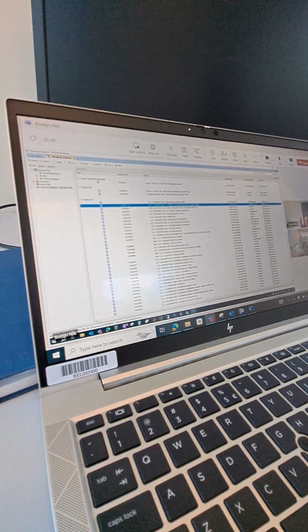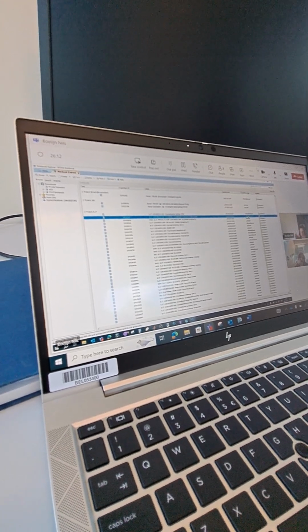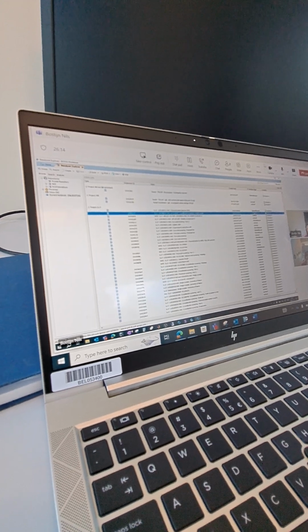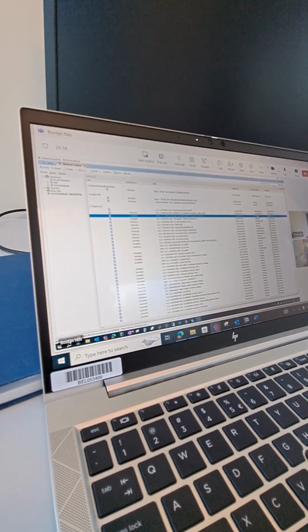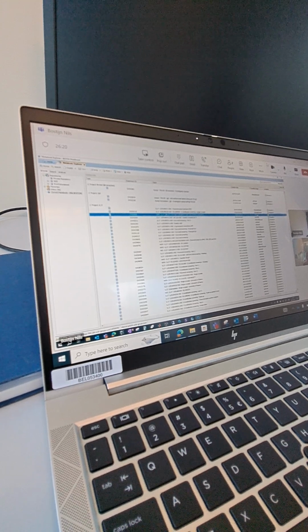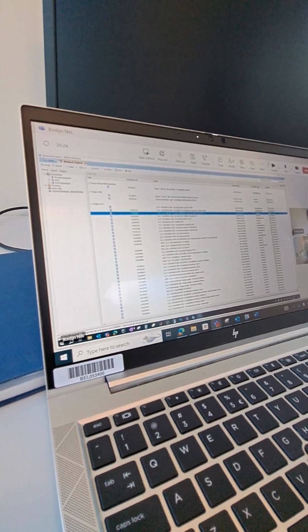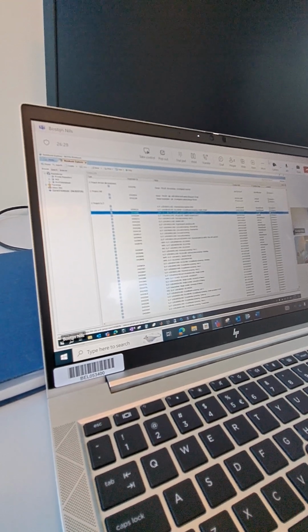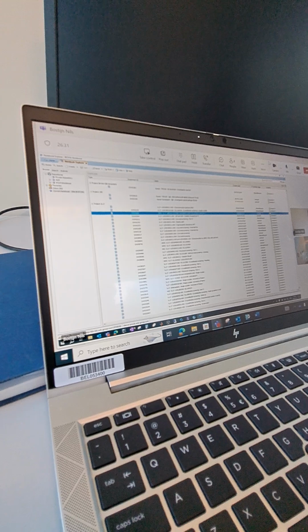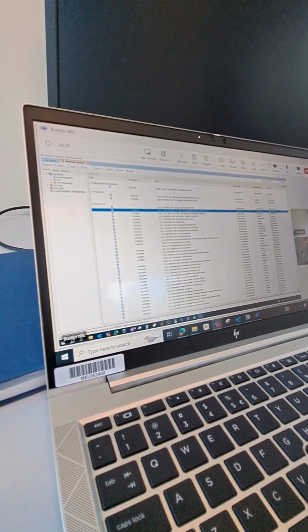Once it's ready, once all the data is in it, you completed the different fields, then you can archive it. So you see here, archived, but for you, we will only do this at the end of your stay here. At the end, we will just need to archive it, to make sure it's well saved in the system. So for you, it will be all plan and execute. And at the end, we will have a look to archive them.